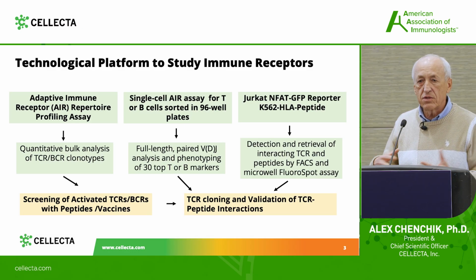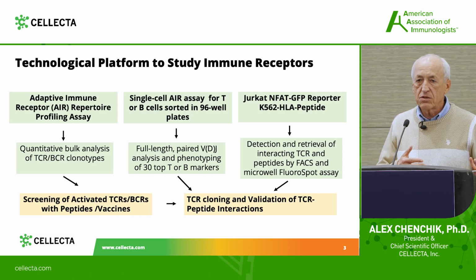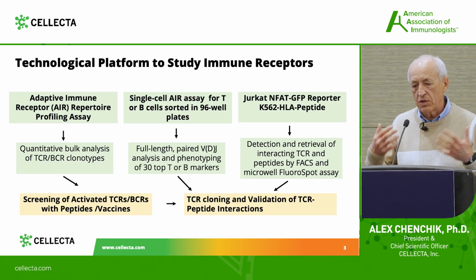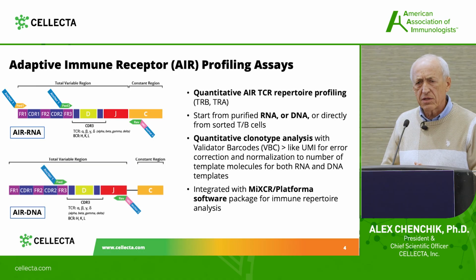And the last one is an artificial cell system based on Jurkat and K562 as antigen-presenting cells, where you can clone T-cell receptors or peptides in order to see how they interact with each other. A short introduction to the bulk assay.